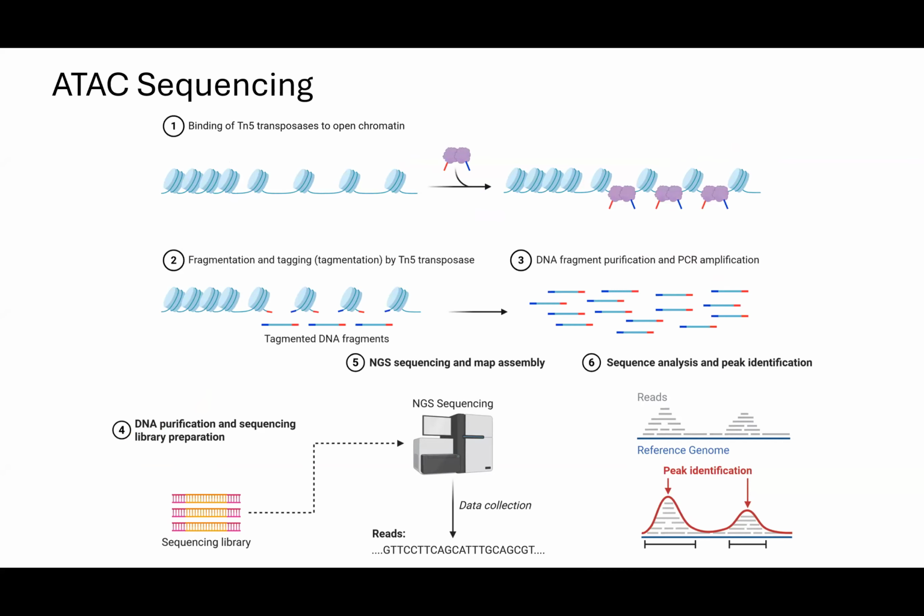The similar technology is ATAC-seq, which you might have heard of, which also has a single cell version. So because single cell ATAC-seq was already developed, you basically use the exact same kind of technology for single cell cut and tag. So the way ATAC-seq works, which is a bit different, is that instead of looking for a specific target, it is only looking for accessible regions of the genome. Here you just add the TN5 enzyme by itself.